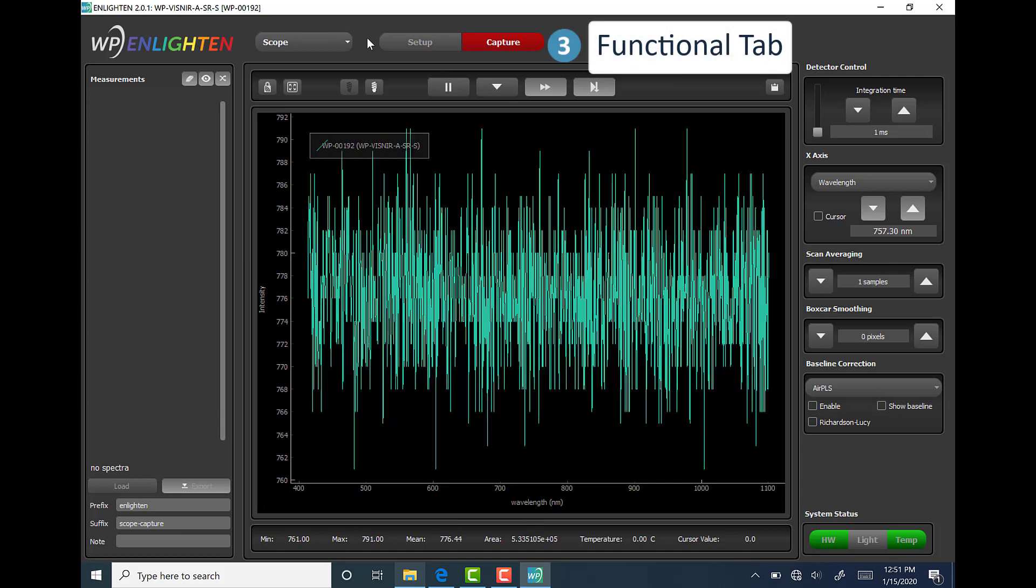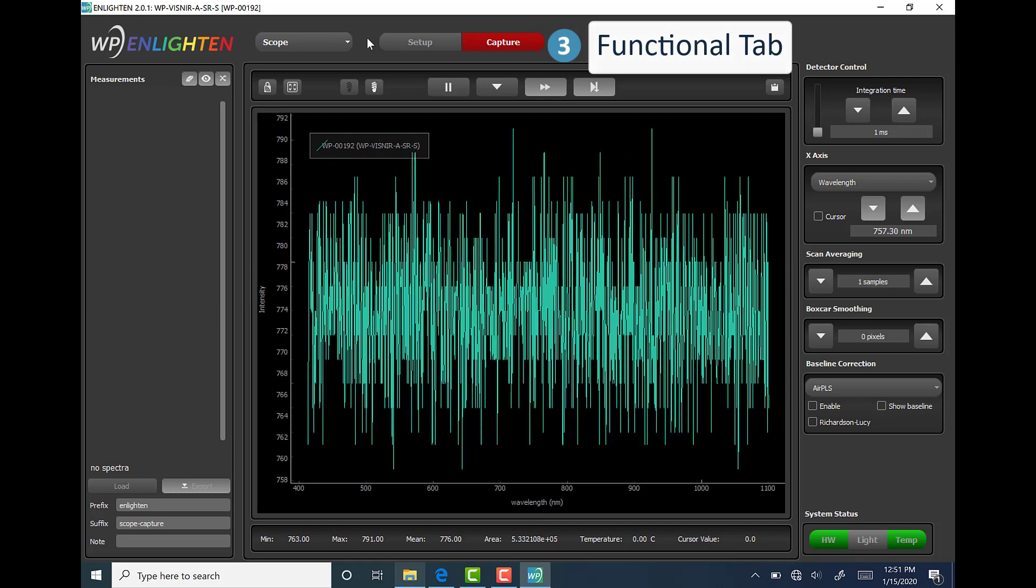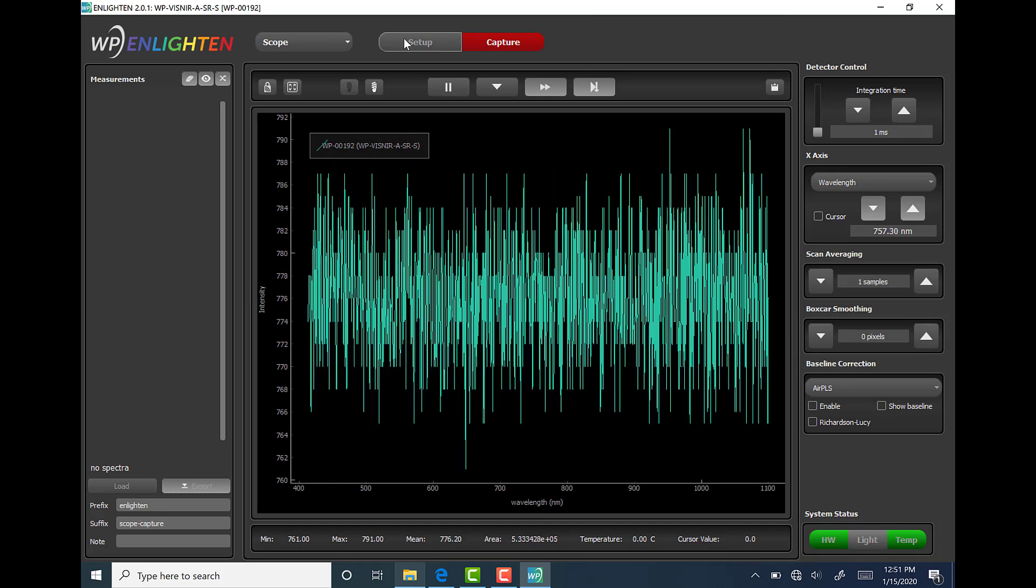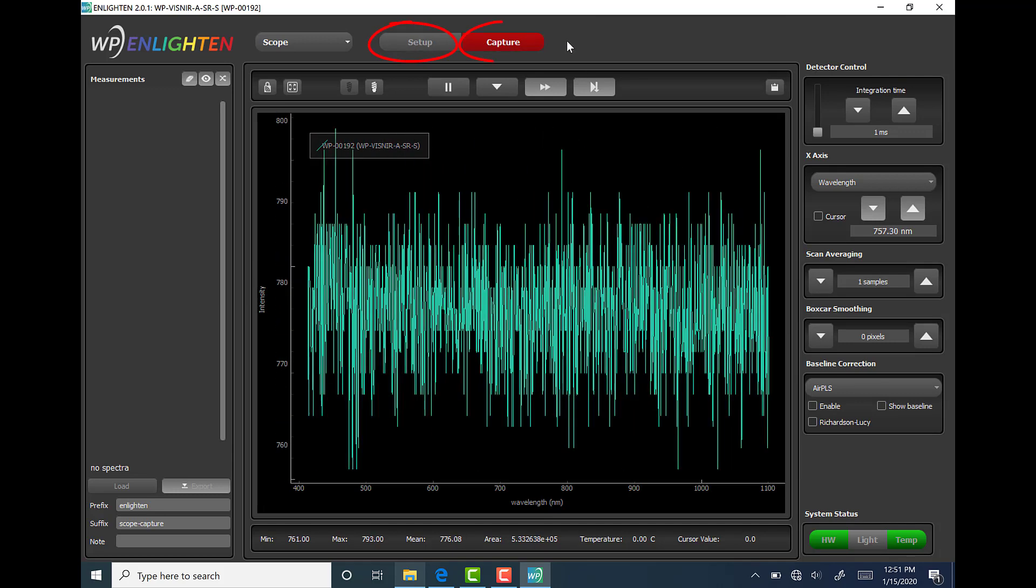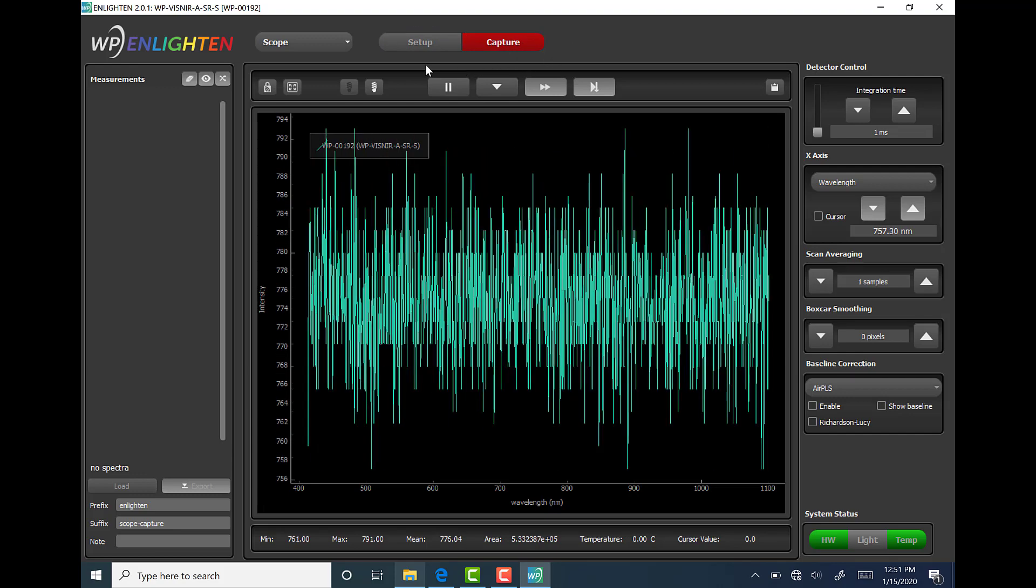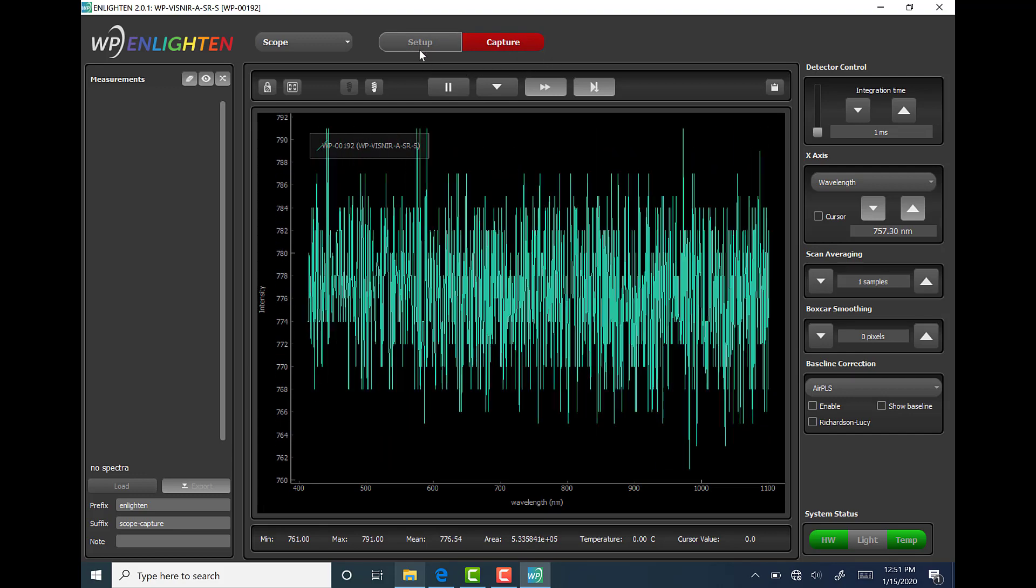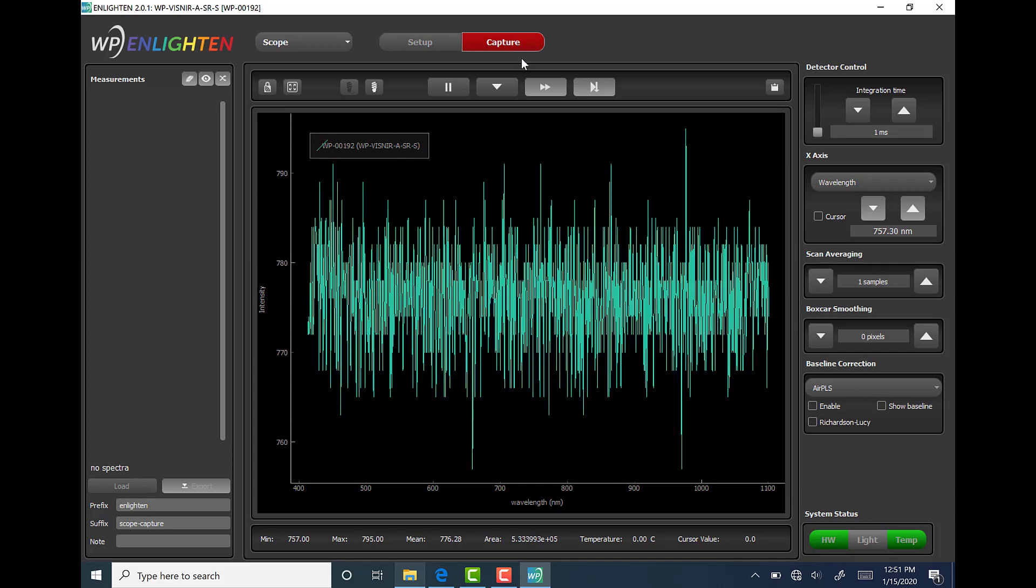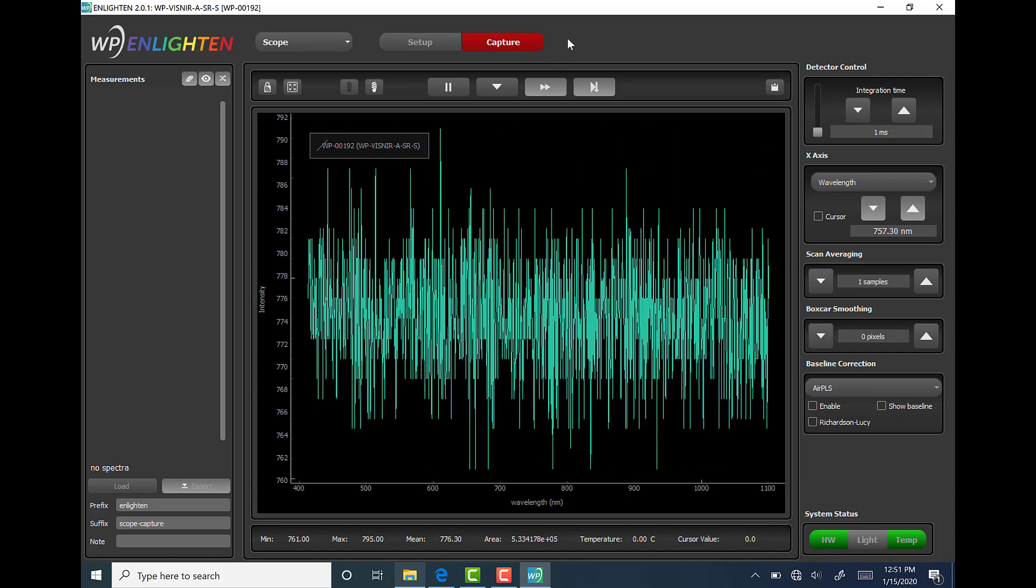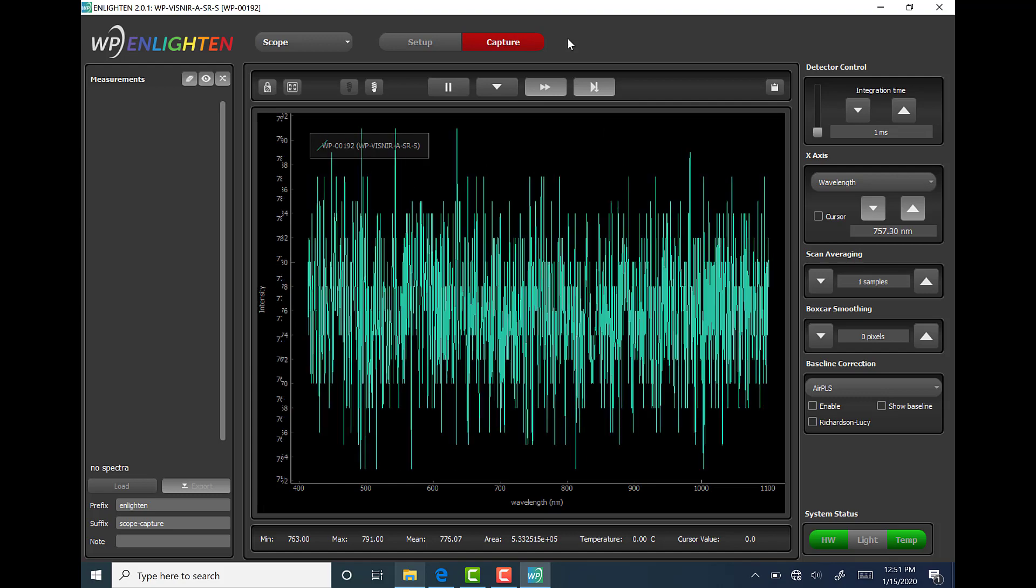The third area is called Functional Tab, found below the window title, and there are essentially two options here: Setup and Capture. The Setup tab contains all configuration settings and the Capture tab contains all the data collection functionality. You can see here that the active tab is always colored red.